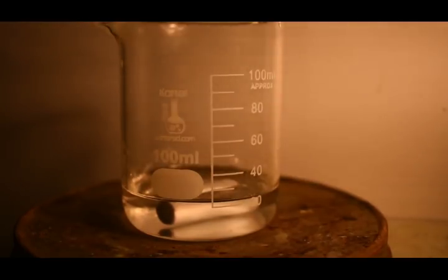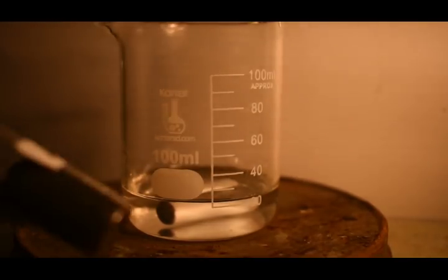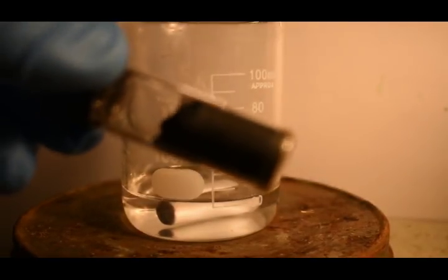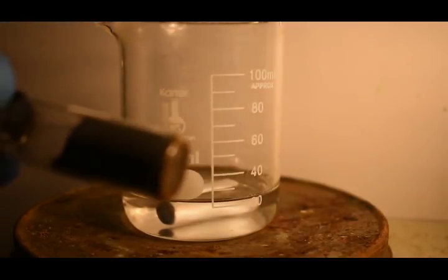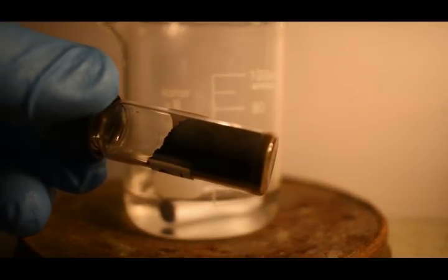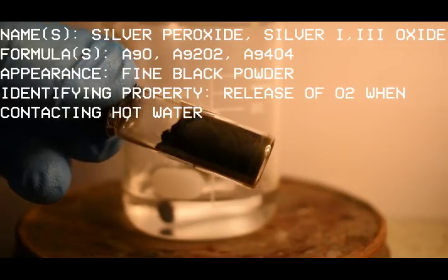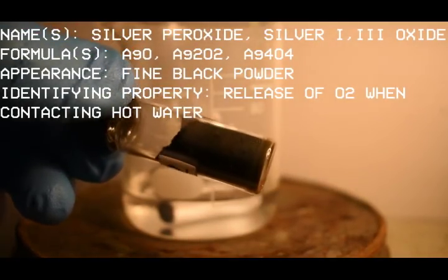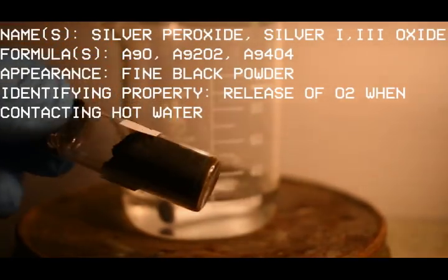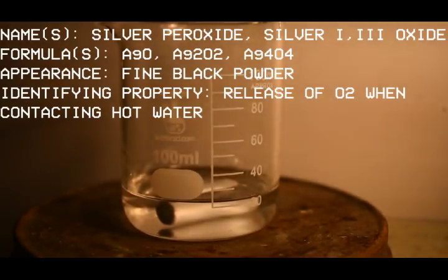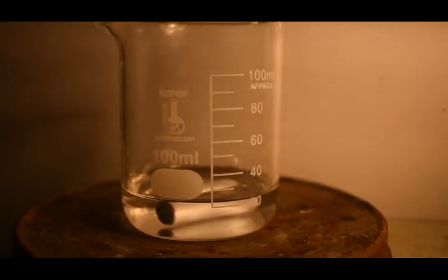What I'm going to be making is a compound called silver peroxide. It's sort of a blackish powder. Actually, I have some right here in this dram vial. It's a sort of loose black powder, a lot different to the brown of normal silver oxide. Silver peroxide has the formula Ag2O2. Although I'm not sure if it's a true peroxide, that's just what the colloquial name's for it. So without further ado, let's get to the synthesis.